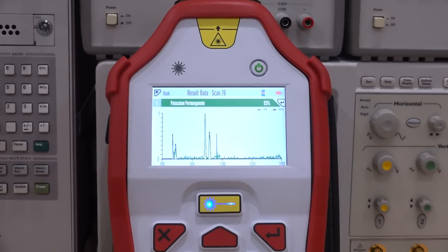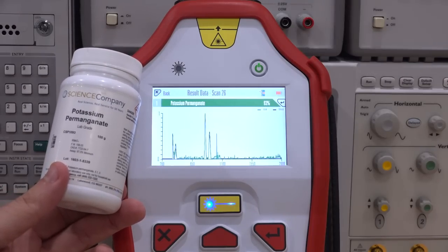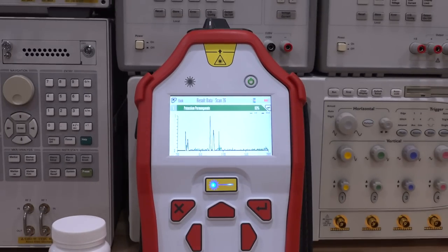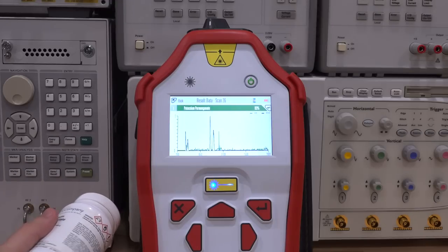Here's the first batch of the scan — you can see there is some signal present. Another batch of measurements is underway. The scan is done, and now it is processing. It has a big database that it has to search through. It says that it is potassium permanganate. But is it right? Is that really what's inside of that bottle? We can take the bottle out — it does have a label on the other side — and it is potassium permanganate. Isn't that incredible? I've done probably over 200 measurements using this instrument by now, and it still feels like a magic trick every time.